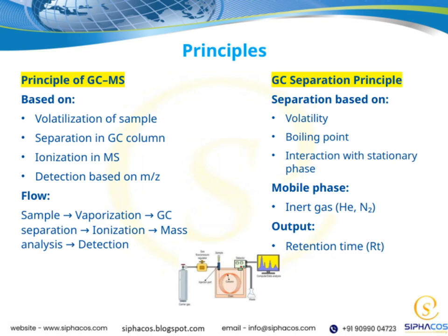The output we get from this process is called the retention time, or RT, which tells us how long each compound spends in the column before reaching the detector.